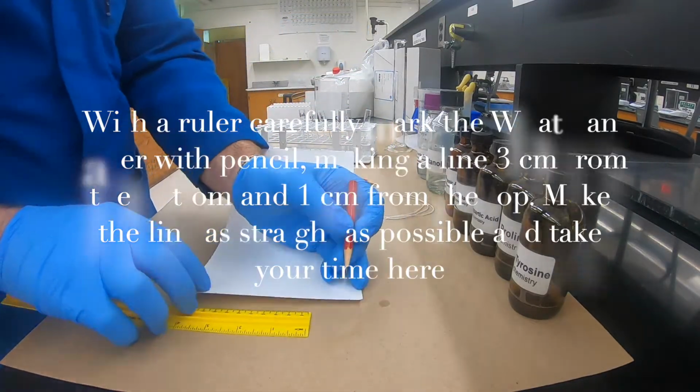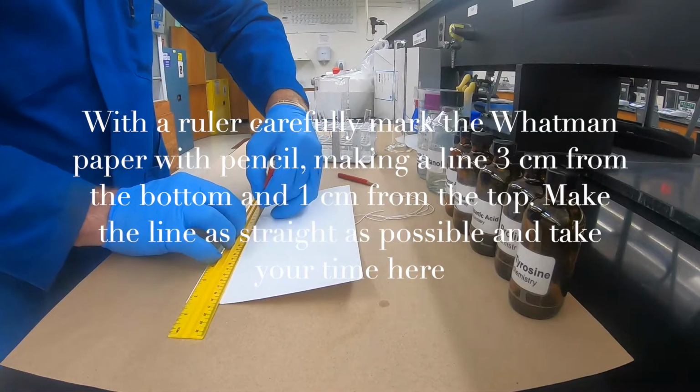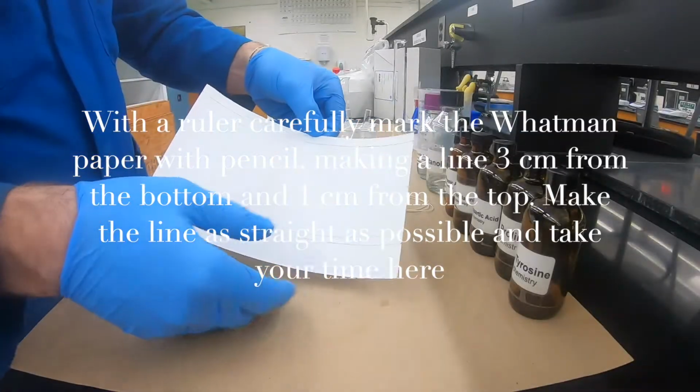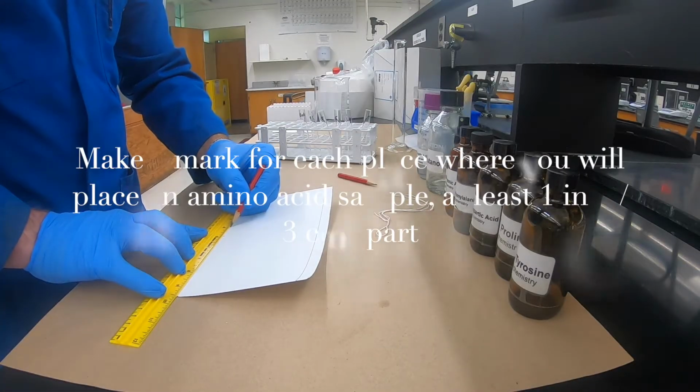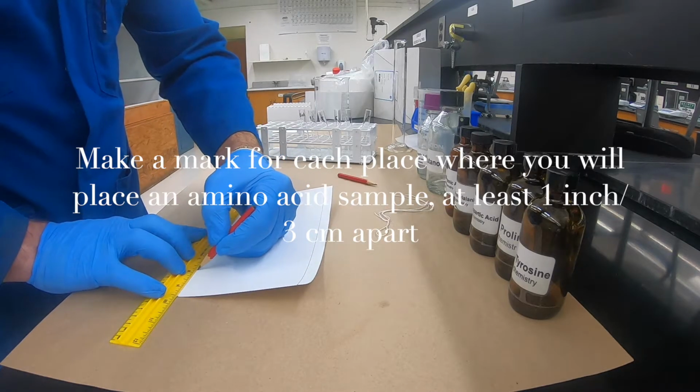With a ruler, you're going to want to make a mark 3 centimeters from the bottom and 1 centimeter from the top. Make them as straight as possible. Make a mark for each place you're going to put an amino acid sample, at least an inch or 3 centimeters apart.